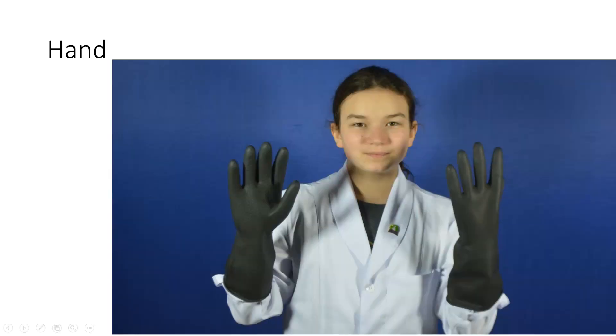One of the things you might use occasionally are things like this, and you can see these are much larger. They are form-fitted to the hand. You place your hands in them. You can see it's got a texture on one side, and this is what you would use if you were sanitizing or using some heavier materials because these are more resistant to tearing. These are a much heavier glove, so you can use this for cleaning and things like that.